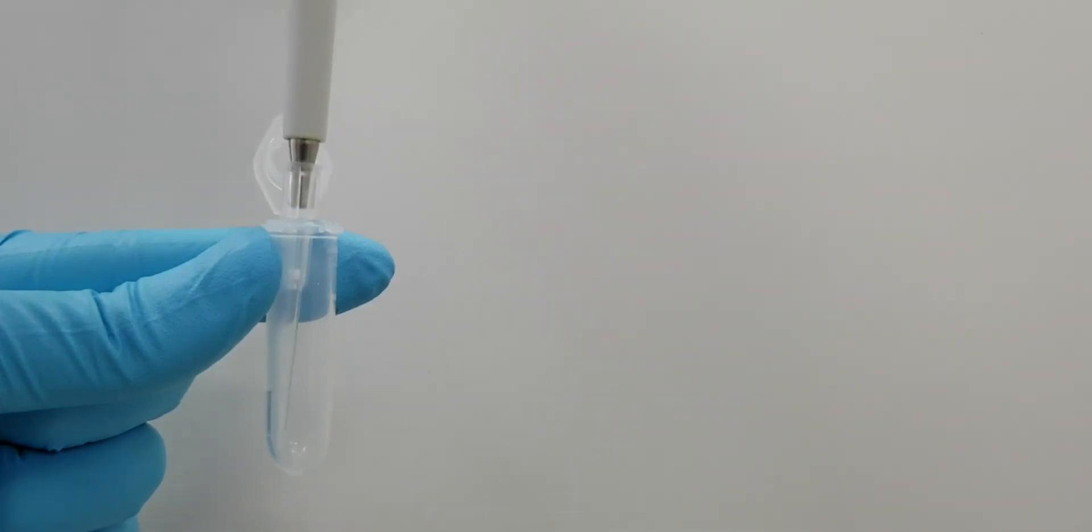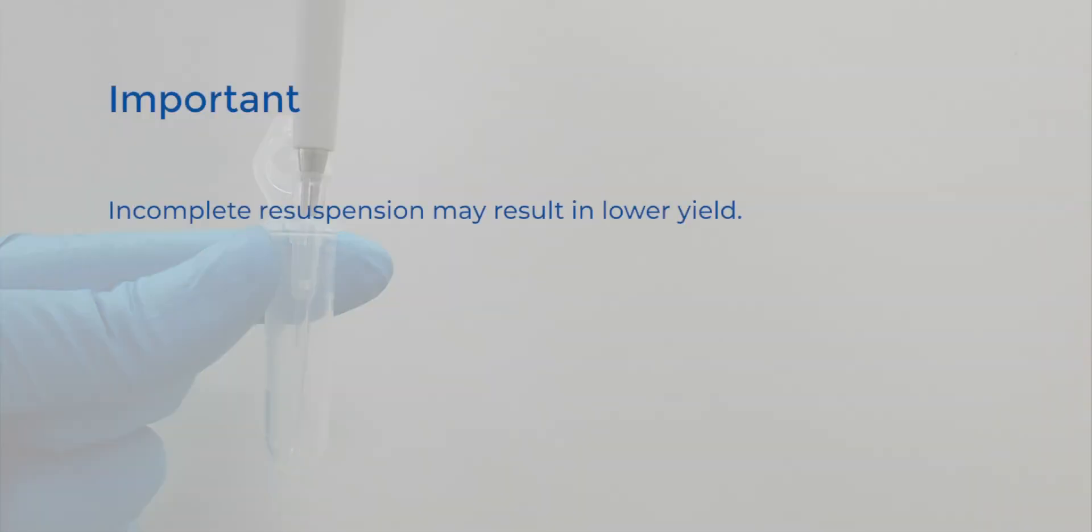Resuspend the pellet in at least 10 microliters of your buffer of choice. Pipette mix up and down at least 30 times to resuspend until the pellet is fully dissolved. Incomplete resuspension of the pellet at this step may result in lower RNA yield.